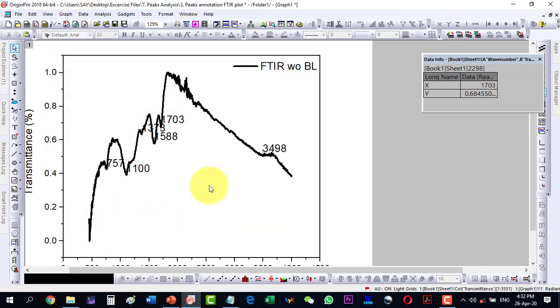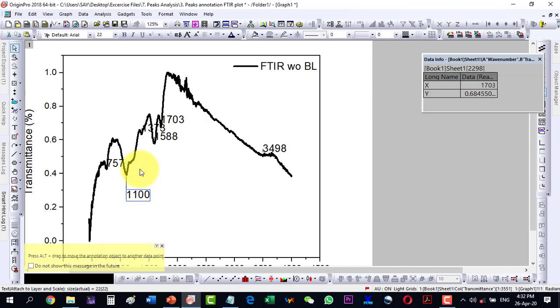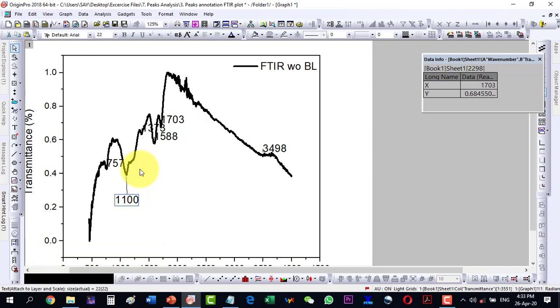Now all the peaks are labeled. If I want to move a peak annotation a bit down, I select it and use the arrow keys to move it, and you see it is changing position. The connecting bar adjusts its size automatically as I move the annotation.